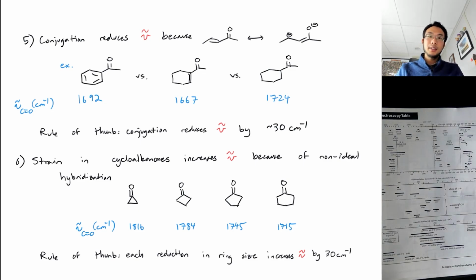So with all this, there are two things that we want to be able to do. We want to be able to take a given molecule and know where to look for significant peaks, so to know where to look for functional groups. And we want to be able to take a piece of data and figure out what functional groups might be in the molecule from which the data was taken.